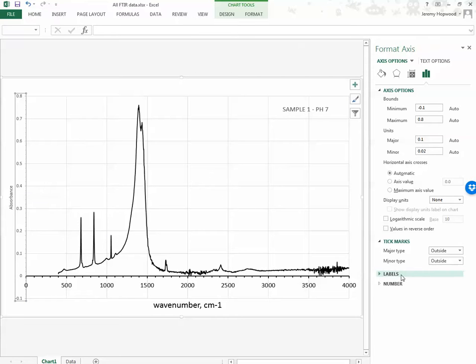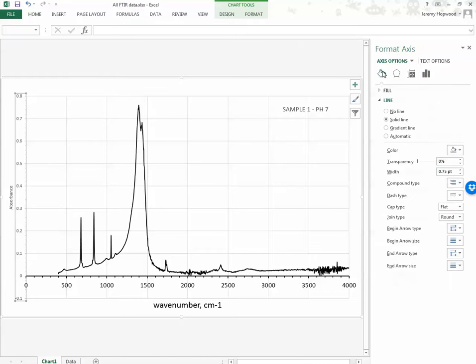And it's grey. So let's see what we've got down here. And we got axes options. There's the paint. The line, we want a solid line. We want it to be black and white. We want it to be bigger. I can't remember. Do we do 1.75 for the other one? They should be the same. These should be the same thickness as those ones. Here, 1.75, and that's all we can do.